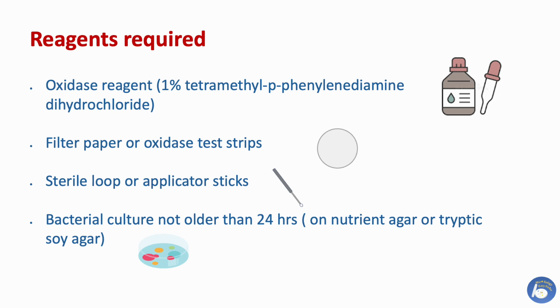Reagents required for oxidase test. Oxidase reagent, which is 1% tetramethylparaphenylenediamine dihydrochloride, filter paper or oxidase test strips, sterile loop or applicator stick, bacterial culture not older than 24 hours.